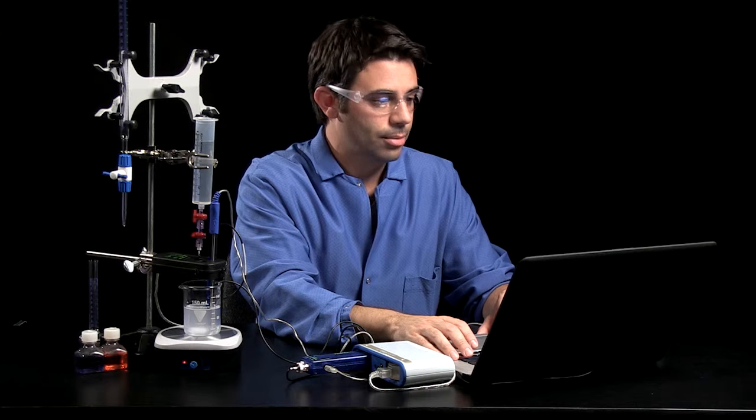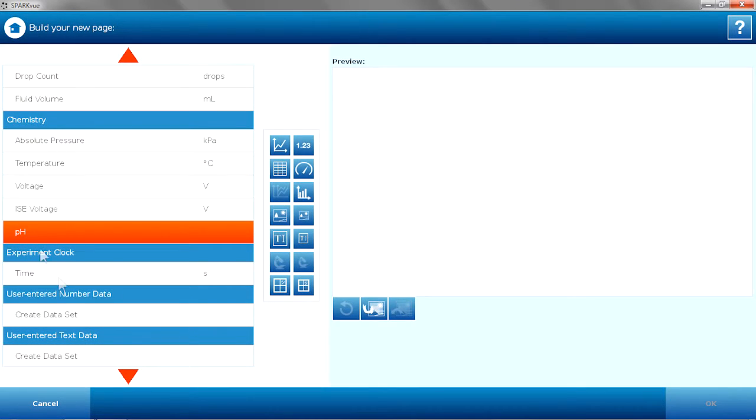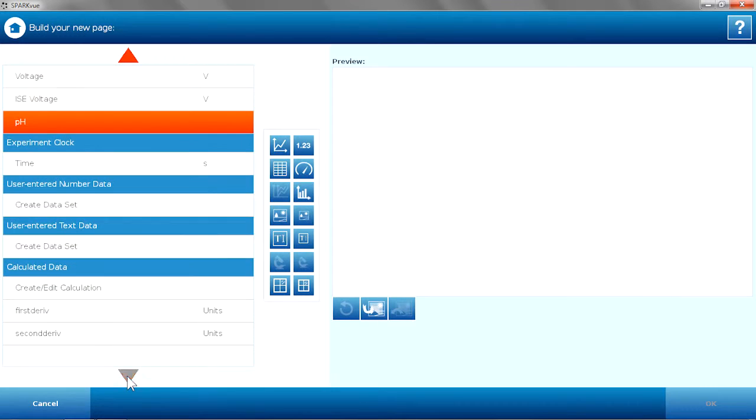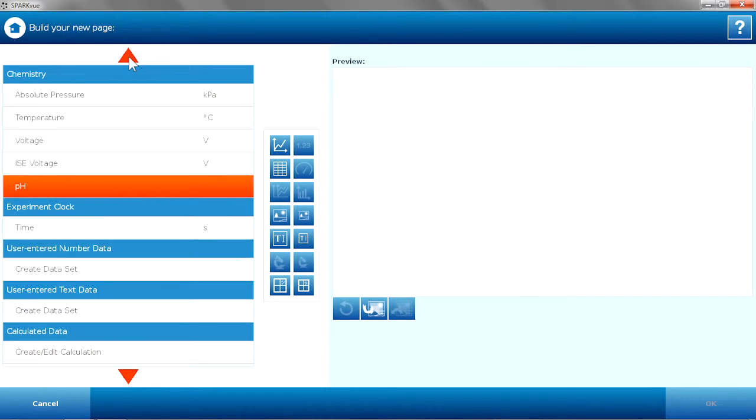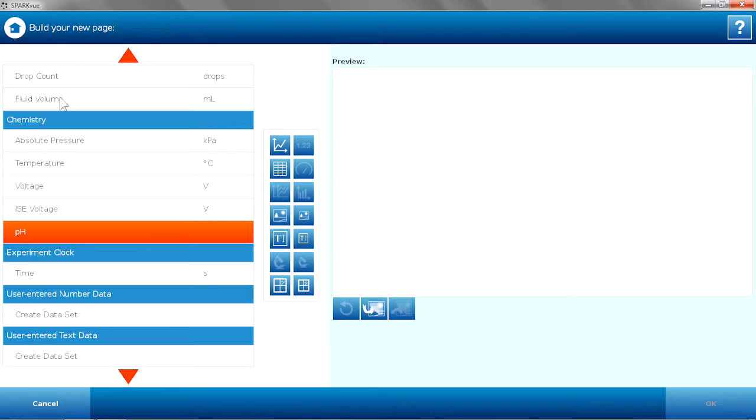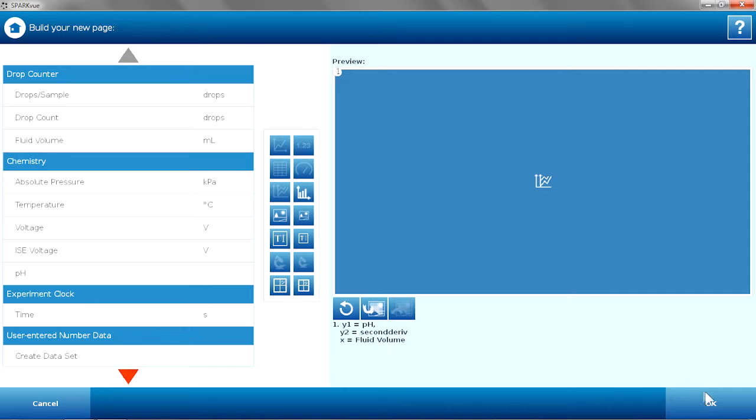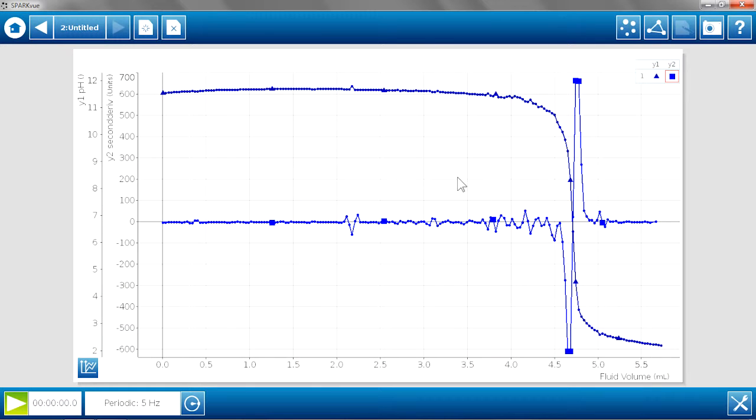And now I'm going to take advantage of SparkView's multiple y-axis. So I'm going to plot pH and the second derivative, both on the same graph, versus the fluid volume. Here's my multiple y-axis feature. And now we have both of those graphs coming in and showing you the equivalence point.